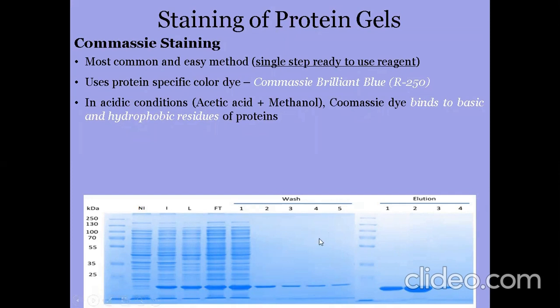If our protein has a histidine tag, it will bind there, then there are washing steps, and then we will elute our specific protein. Say for instance we have a recombinant protein, and we know we have attached a histidine tag to that protein.